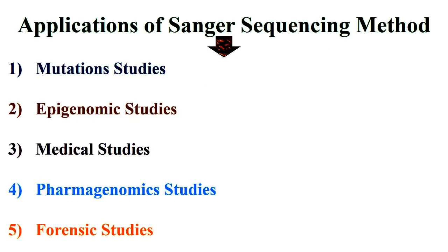Therefore, the Sanger sequencing method is used in mutation studies, epigenomic studies, medical studies, pharmacogenomics studies, and forensic studies.